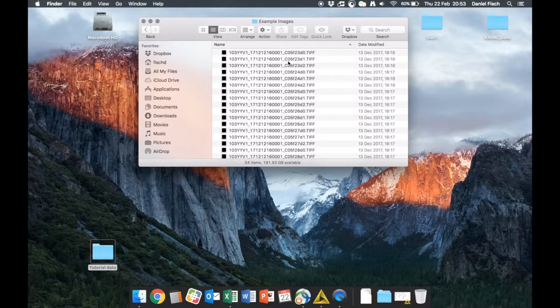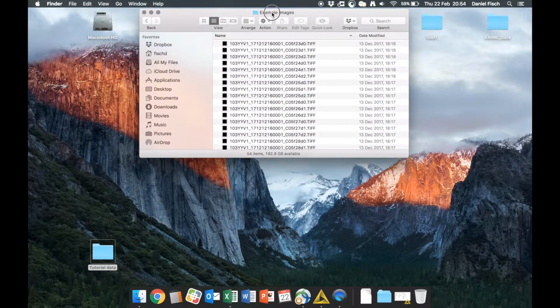You need a training data set for the replication prediction, and you need a trained neural network for the recruitment analysis if you want to perform recruitment analysis. There's also a truncated version of HRMAn that doesn't analyze recruitment but analyzes just the infection and will give you fewer readouts, but it's enough to quantify infection in quite high details. And if you have all of this in place, you're good to go to use HRMAn to analyze your images.